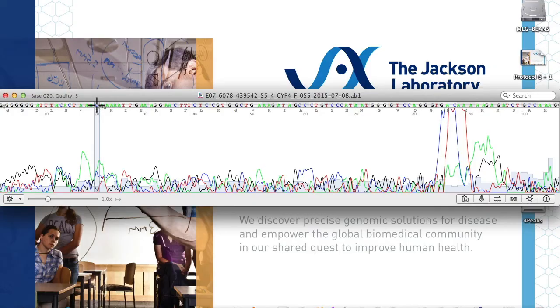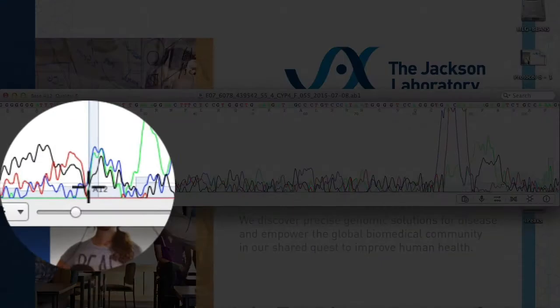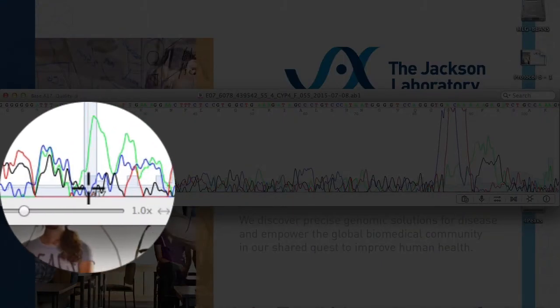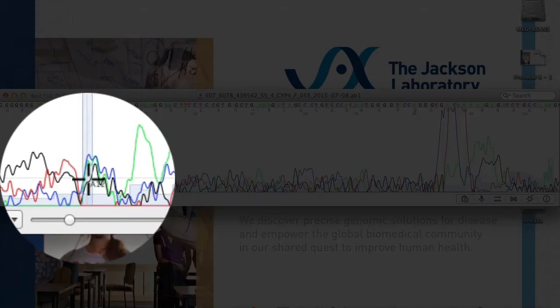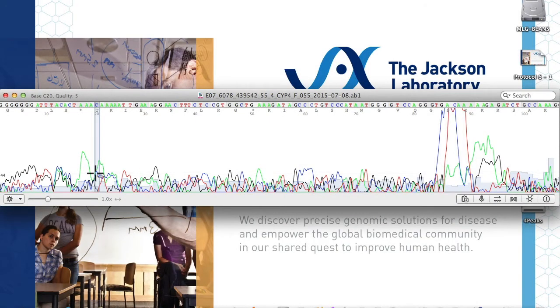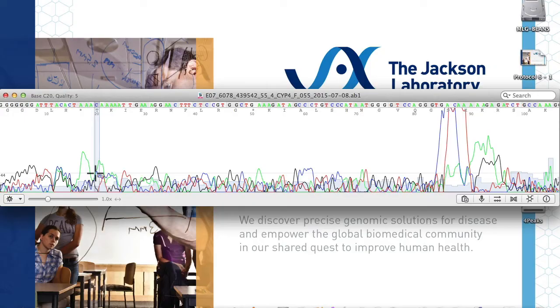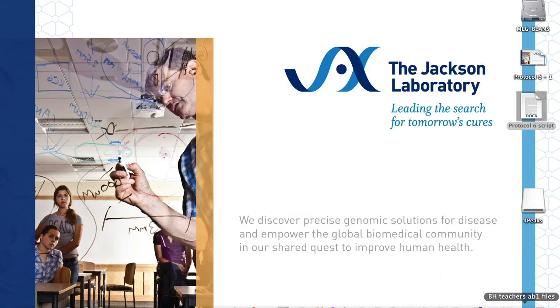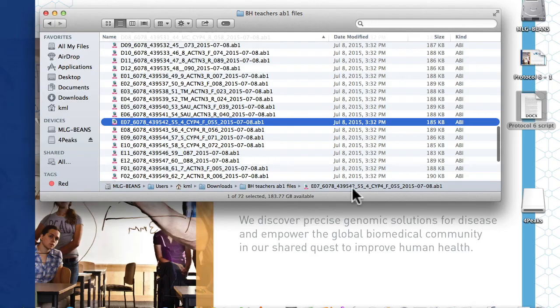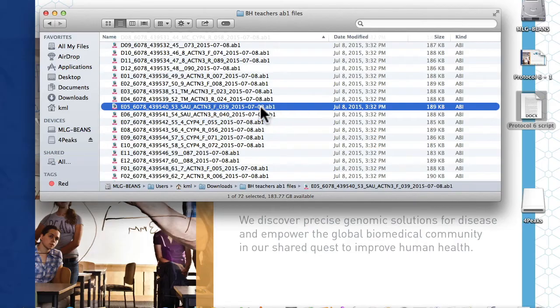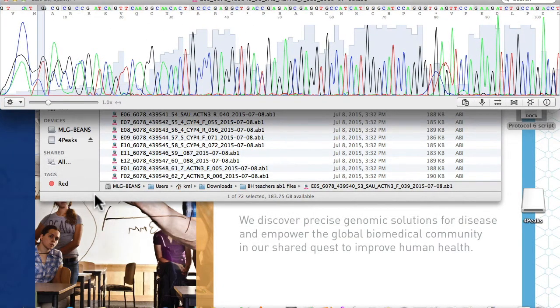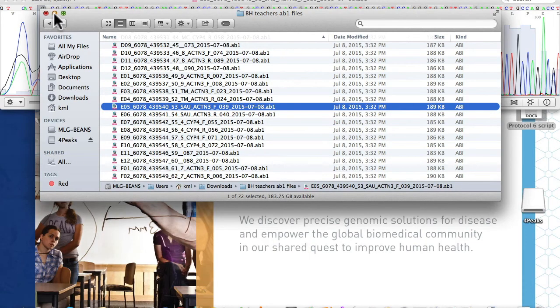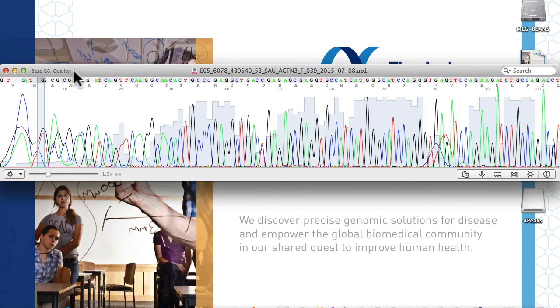In this example, the entire file is of poor quality, where you can see overlapping lines, jagged lines, and broad lines. This could be due to contamination of the sample, multiple PCR products, or improper priming or process of the sequencing reaction. Either way, this data is completely unusable.